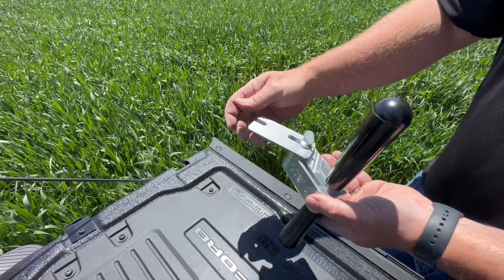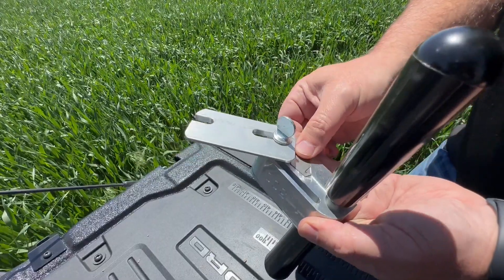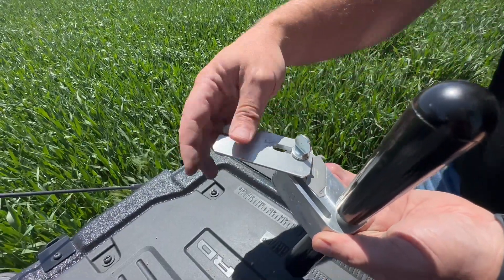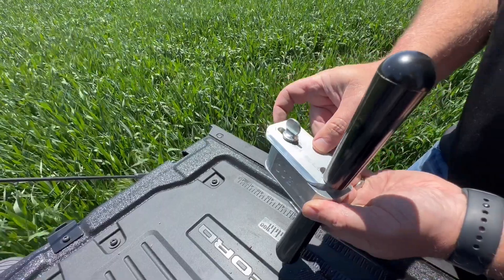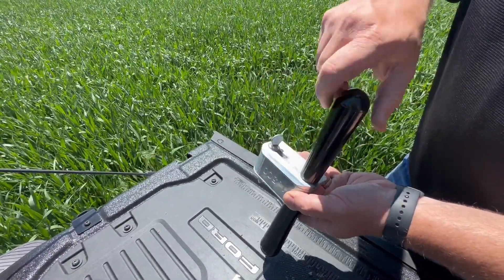To do so, loosen the handle and thumb screw so the cover plate can be moved to the side. Set your first blade in the appropriate spot, move the cover plate back, and then tighten the thumb screw and handle. This process will need to be repeated when installing the second blade.